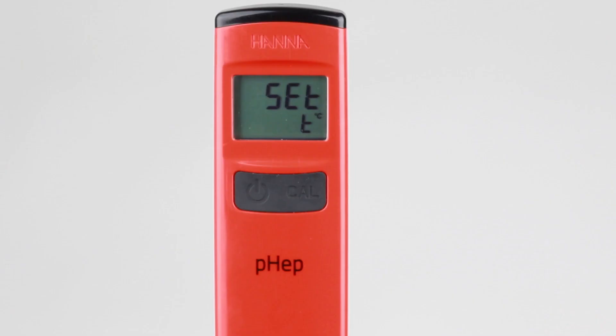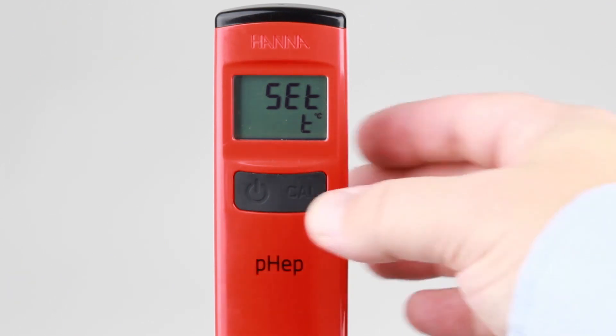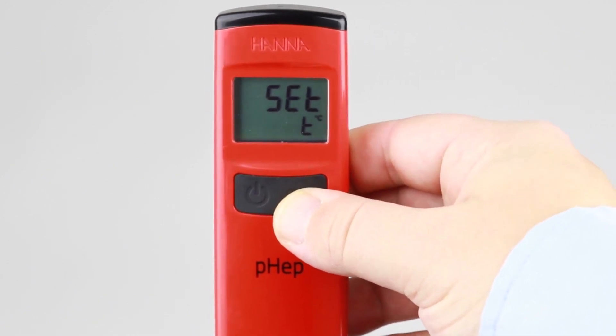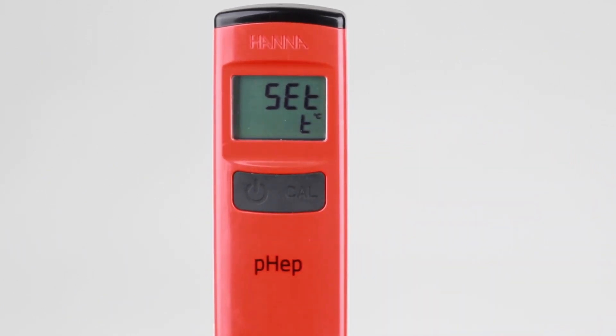The first setting displayed is a selection for temperature unit. At default, the temperature measurement unit is degrees Celsius. Pressing the CAL button changes the displayed unit to degrees Fahrenheit. Pressing the CAL button again changes it back to degrees Celsius.